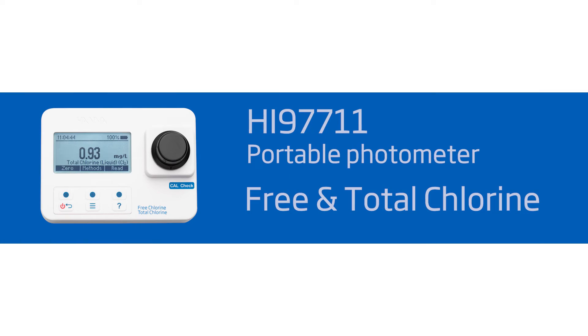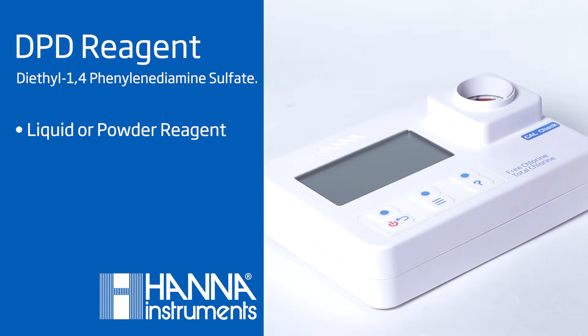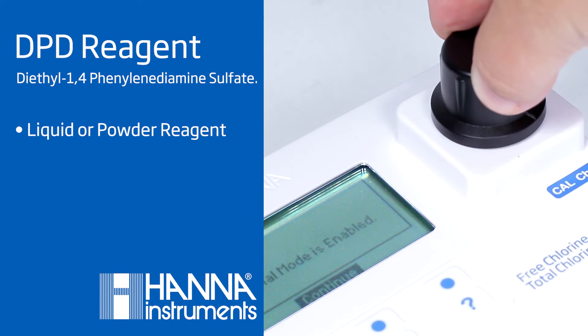The HI97711 is part of Hanna Instruments' newest line of portable photometers and measures free and total chlorine up to 5 milligrams per liter. It uses a DPD reagent to produce a reddish pink color that changes in intensity with the chlorine concentration in the sample.